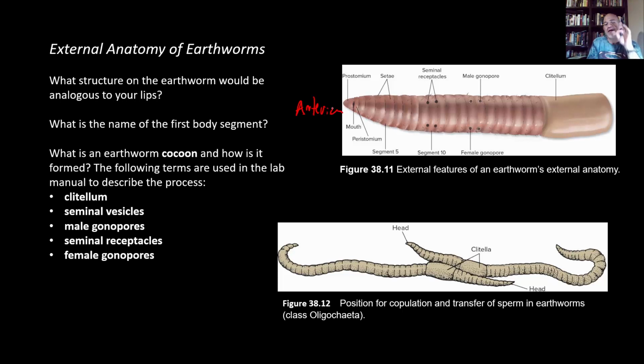If you had a specimen, as we would normally provide in a laboratory situation, and rub your fingers along the surface, you'll know you're on the belly side when you can feel the little bumps, or the setae. They're not very big, but they're big enough to feel with the sensitive touch of your fingertips. If you put them under a dissecting scope, you can get a better look at those. So here we're actually looking at the ventral side of the animal.